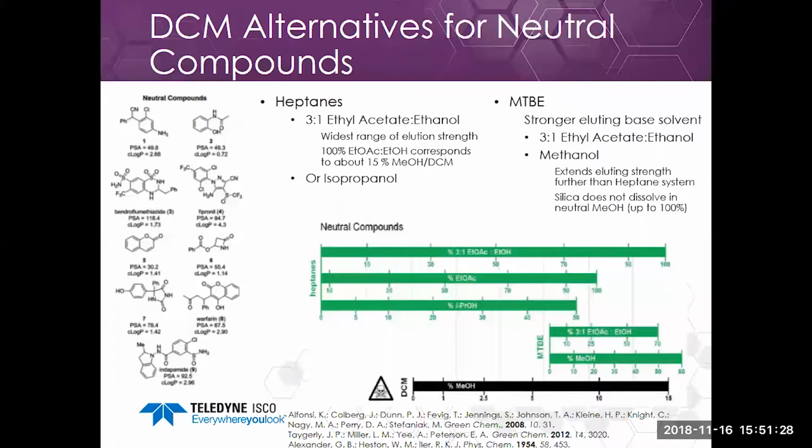One thing to keep in mind here is that there seems to be a common misconception that silica begins to dissolve in methanol above 20%. Under neutral conditions, that's not true. You can go up to 100% methanol using neutral or acidic conditions. The problem is with basic conditions, which we'll discuss in a sec. So just be aware of that.